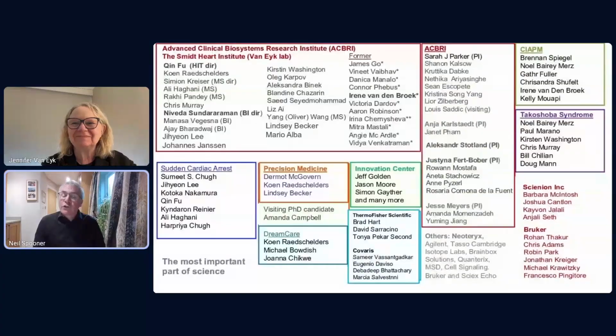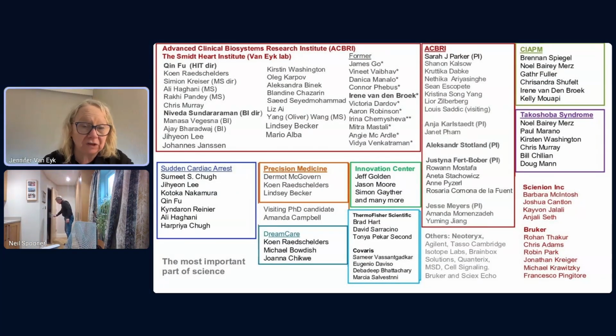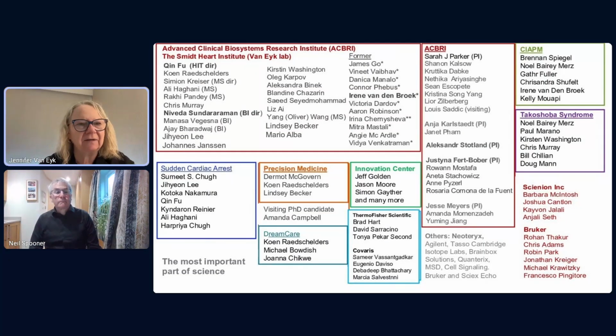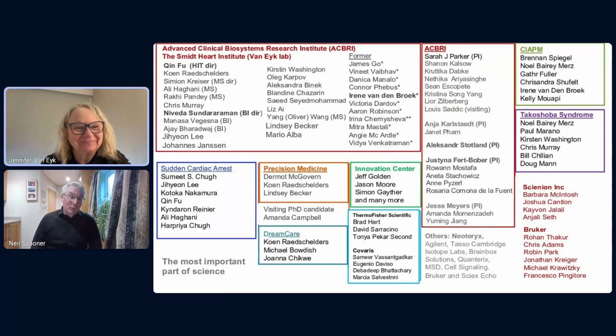Absolutely, Jenny. So we've got a question here from Ian. Thank you, Ian. How much improvement would you expect to see when you automate the Seer nanoparticles? Yeah, that's a great question. So right now it's plate-based, and we all know pipetting's pipetting. So I would expect to see the numbers will not change. I don't think we're going to see more protein, but I do think the coefficient of variance will drop in half. So it's probably going to get down from where it's hovering now at 20% for, let's say, 80% of the proteins. I think we'll probably get that down to 80% of the proteins under 10% coefficient of variance. Okay, that sounds cool. But we'll see, right? You have to do the experiment. Yeah, we're scientists. Hopefully that answered your question, Ian.